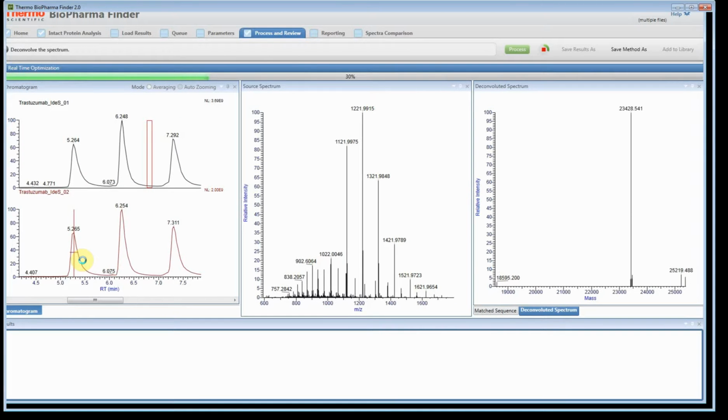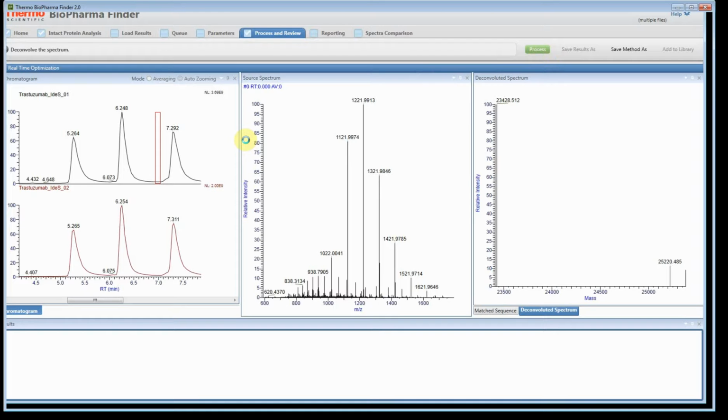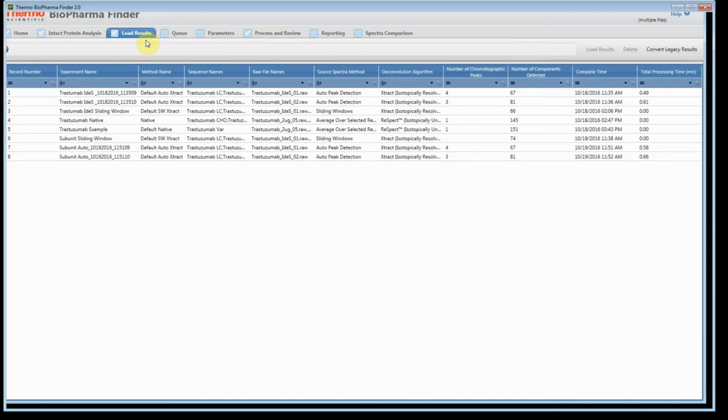The final merger is bringing the results from these two experiments together into a final results table. Okay, so we have a lot of merging happening here to make sure you kind of keep that straight. What I'm going to do is I'm going to stop it because it is kind of slow. And I'm going to show you one that I've already processed.